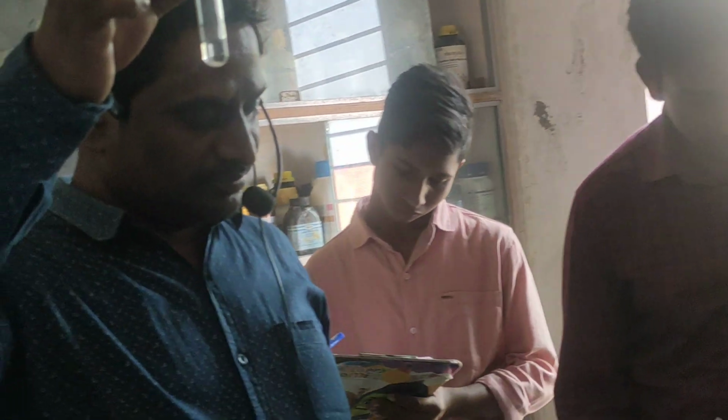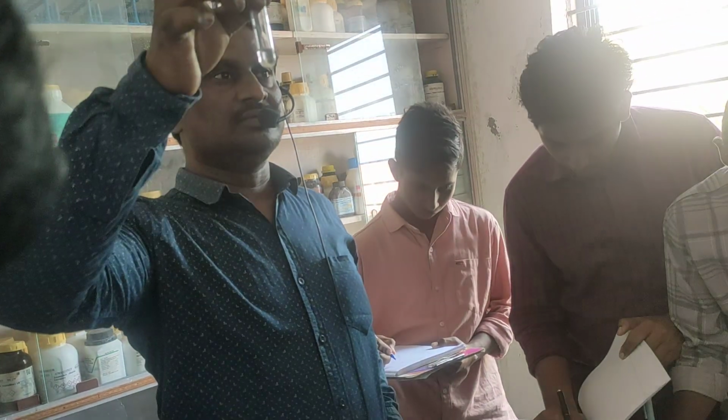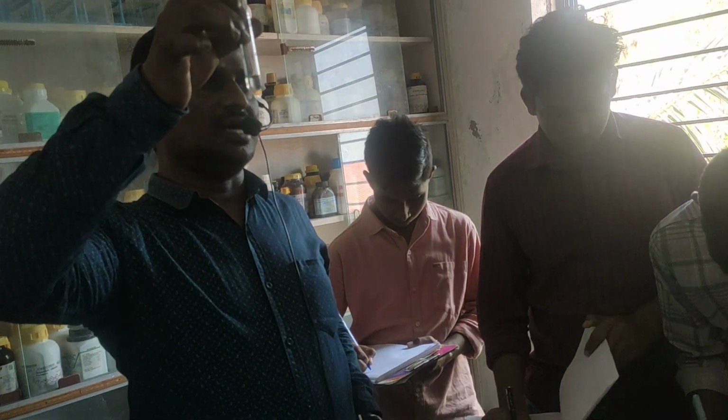Write the third point, all of you: Solubility. Salt plus water, insoluble. CO3 minus 2 may be present.